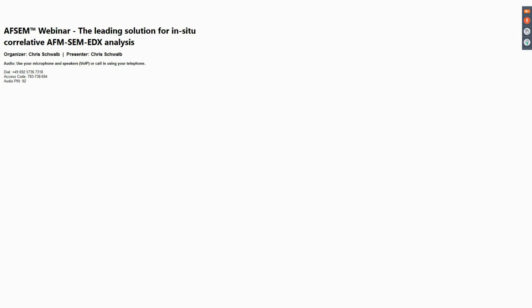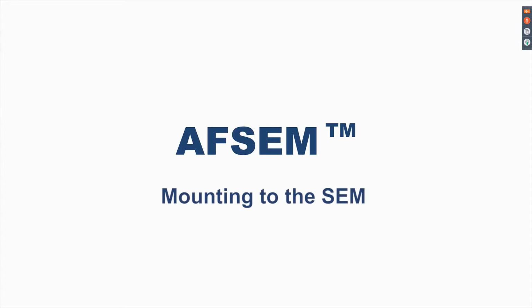Now it is time to start our experiment in the SEM. In order to again assure that everybody is able to see the video, even with lower internet bandwidth, I will wait for a short period of time before starting the video.